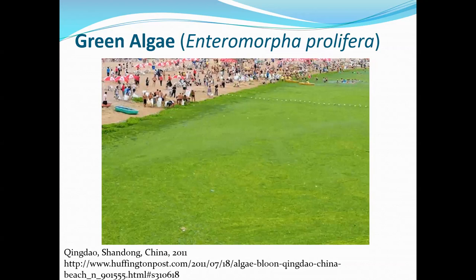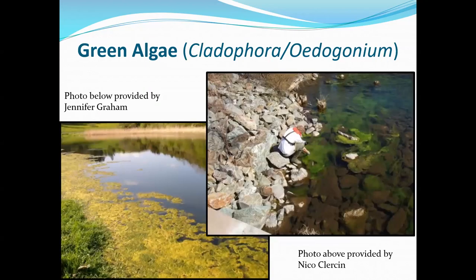Get things like this, which Ken has pictures of, Hydrodictyon like this. This is Enteromorpha. But again, bright green algae. If it's bright green, it has this kind of 3D effect to it on the shore. Sometimes Cladophora can do that as well. It is definitely not going to be cyanobacteria.